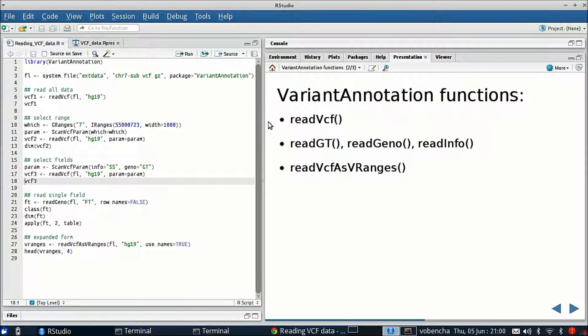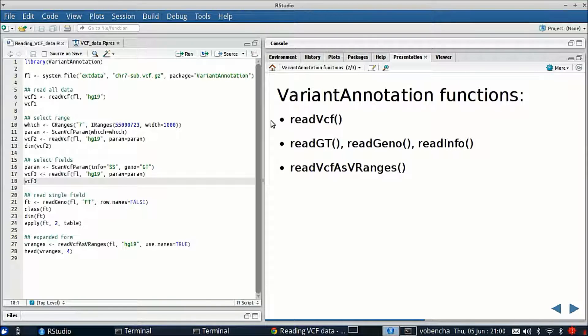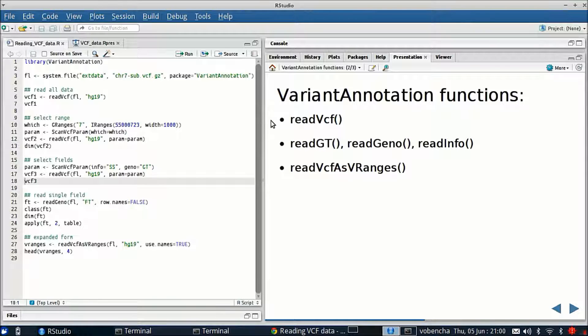Variant annotation has several functions for reading in data. The first one is ReadVCF and this function allows you to read in subsets of data or all of the data, and it reads it into something called a VCF class in R.